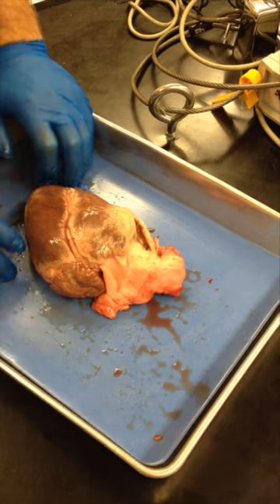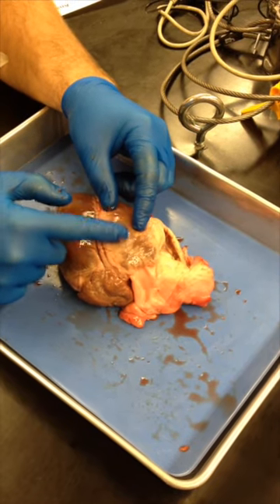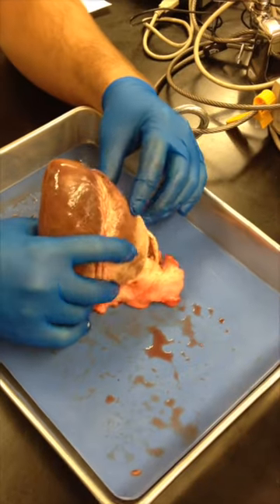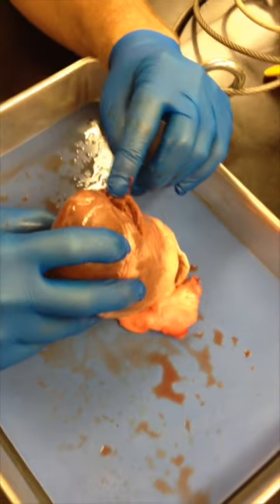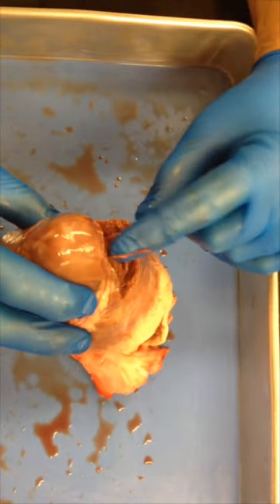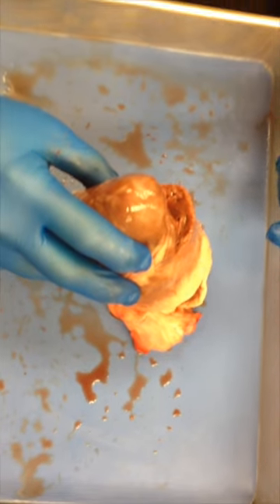So, outside the pericardium, the parietal is the next layer, and then the visceral is the part that's also the shiny thing, right on our heart, the epicardium. Okay, then myocardium. If you look inside here, you can see the meat of the myocardium. There's this layer, then the middle is darker red, and the inside is shiny again, that one layer of endocardium, right? They said it's only one layer thick, right? Yeah. Okay. Ductus arteriosum.